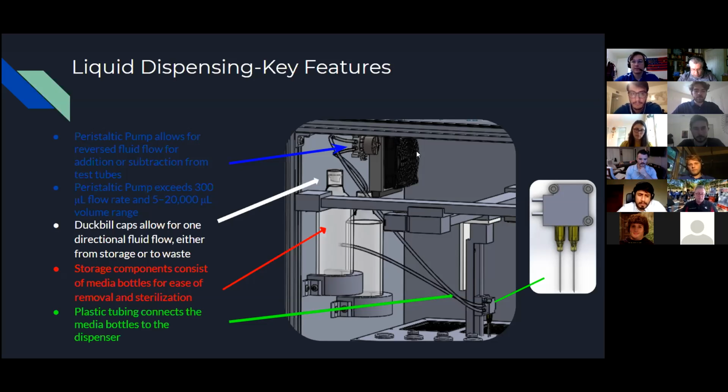Okay. And when you're extracting fluid and dipping the tip of a syringe or whatever into multiple well plates, do you have a capability of sanitizing that between contact? Yeah. In our current design, we don't have a solution, but we have envisioned that you might be able to add a sanitizing station that your dispenser could visit. Maybe it's a liquid that it can dip into in between tubes, but we don't have that included at the moment.